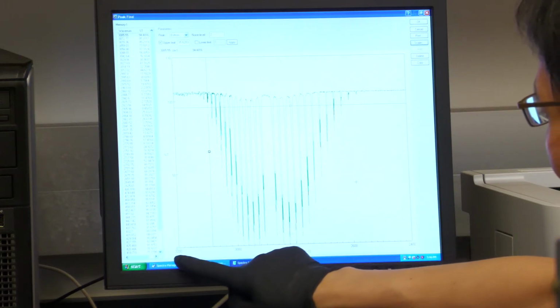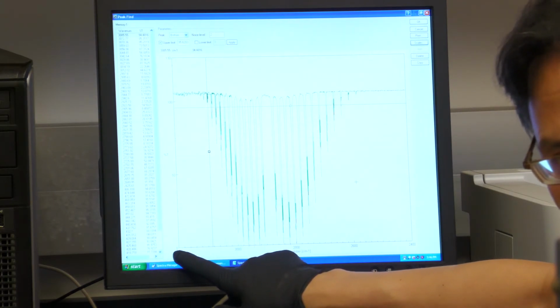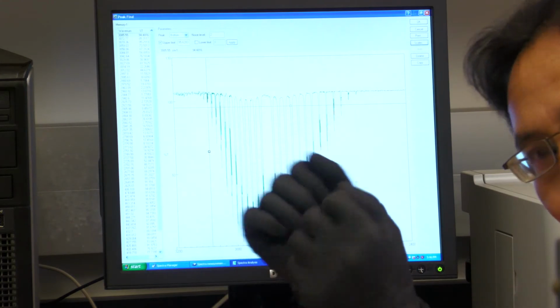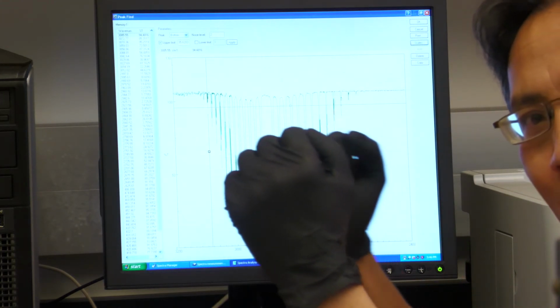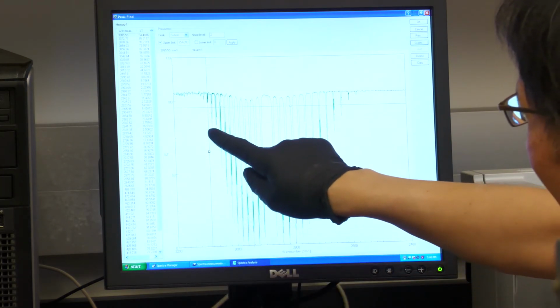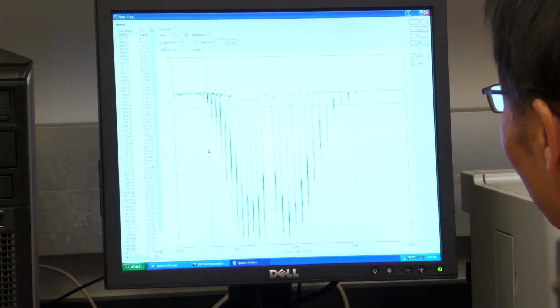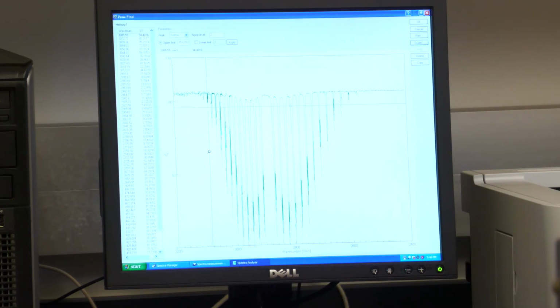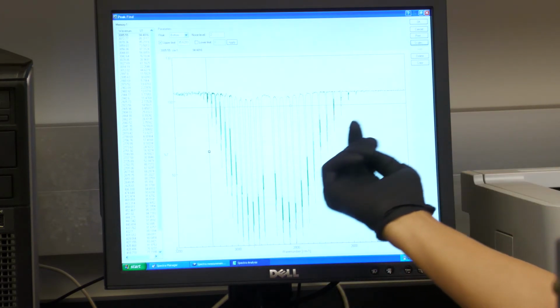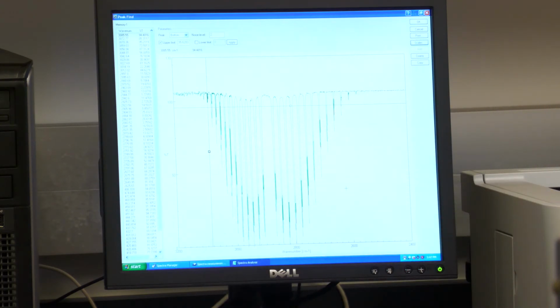You can see this one, okay? This is the high frequency end, right? The wave number corresponds to frequency. The higher the frequency, that means the vibrating faster. The vibrating faster means it must be lighter, so the atoms must be lighter. So this high peak actually is chlorine 35, okay? The lower peak actually is chlorine 37, because the lower peak is shifted to the slow frequency side, okay?